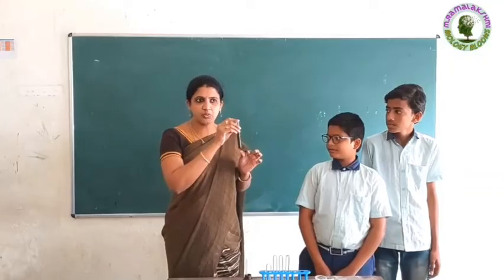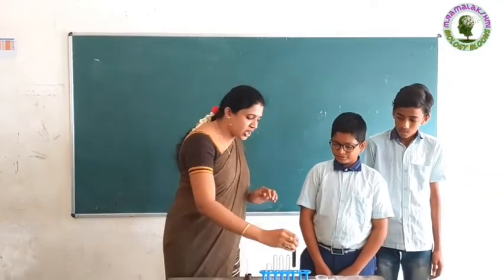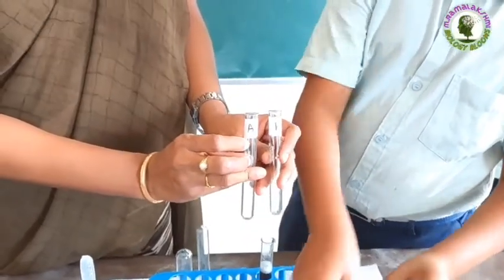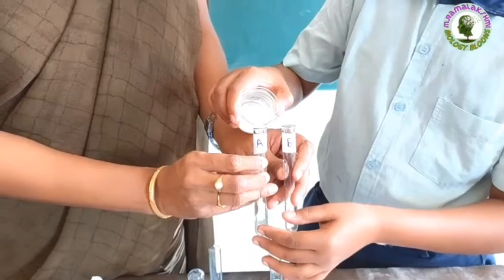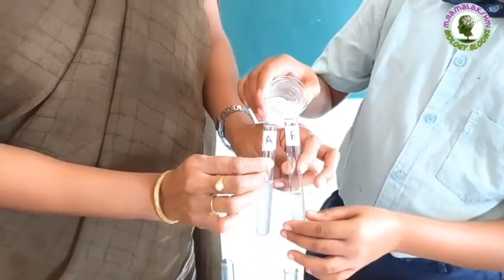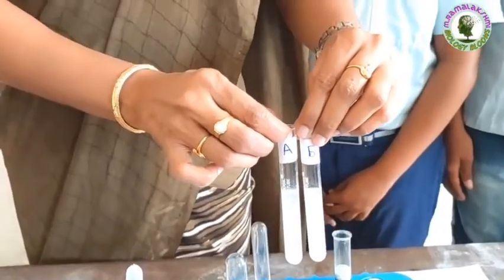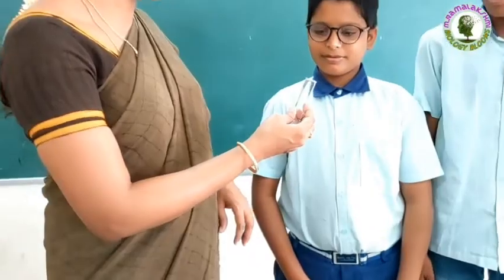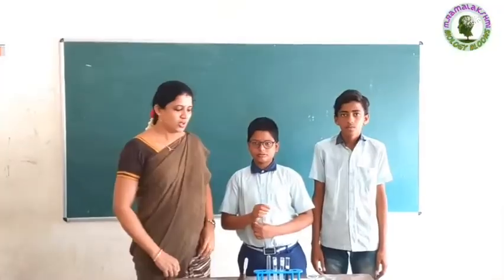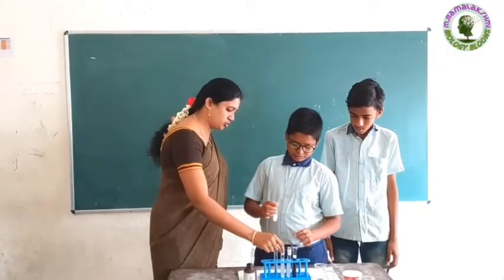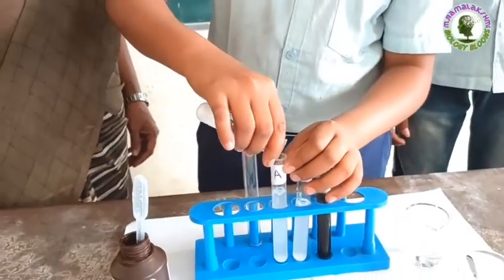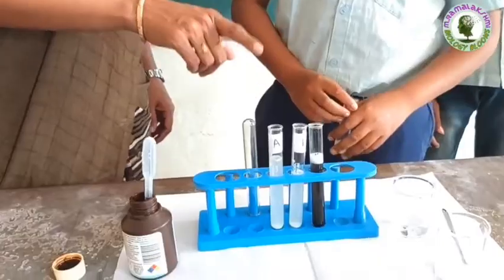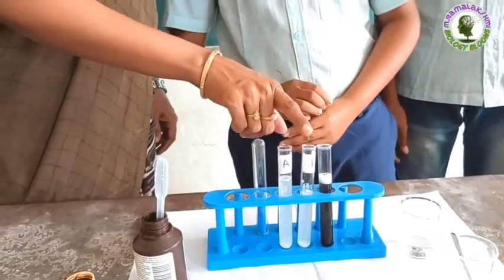Is it true? Yes, it is a starch solution. So, Shyam, now pick the same quantities of starch solution into both test tubes. One test tube is labeled A and another is labeled B. We took the same quantity of starch solution into both test tubes. Now, Shyam, collect the fresh saliva and add your saliva into test tube A. Children, observe that test tube A contains saliva, but we have not added anything into test tube B.